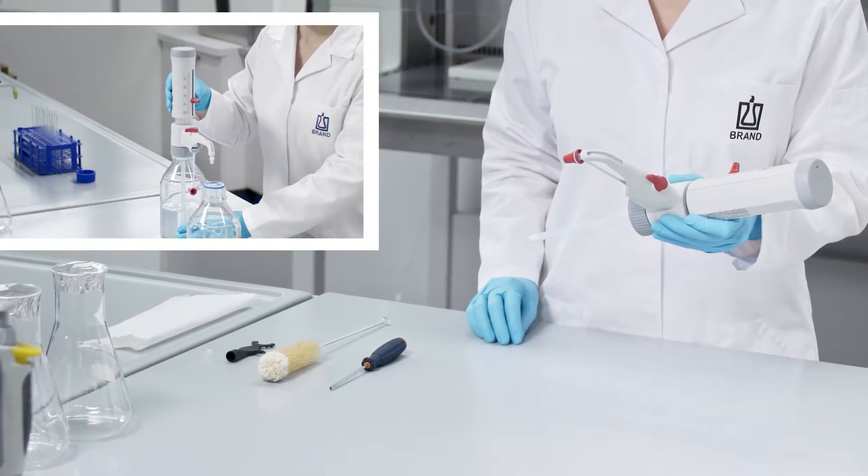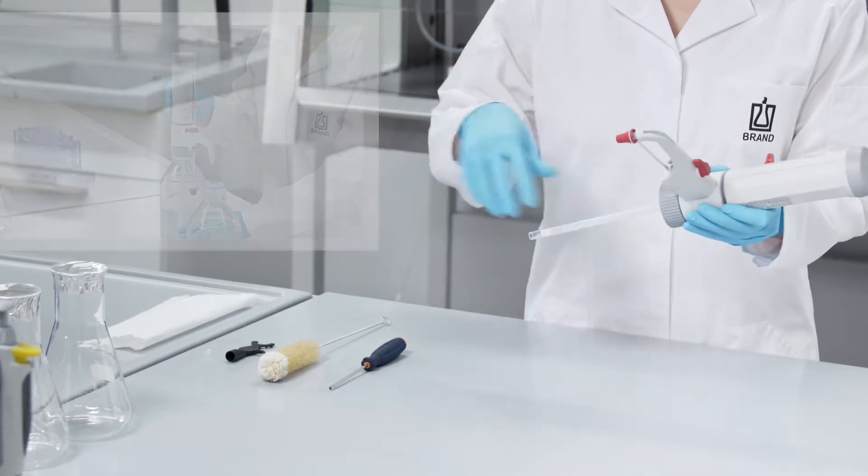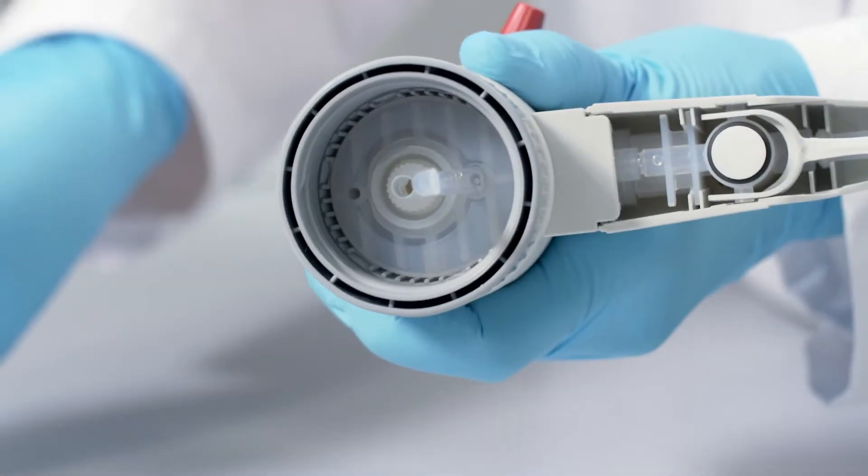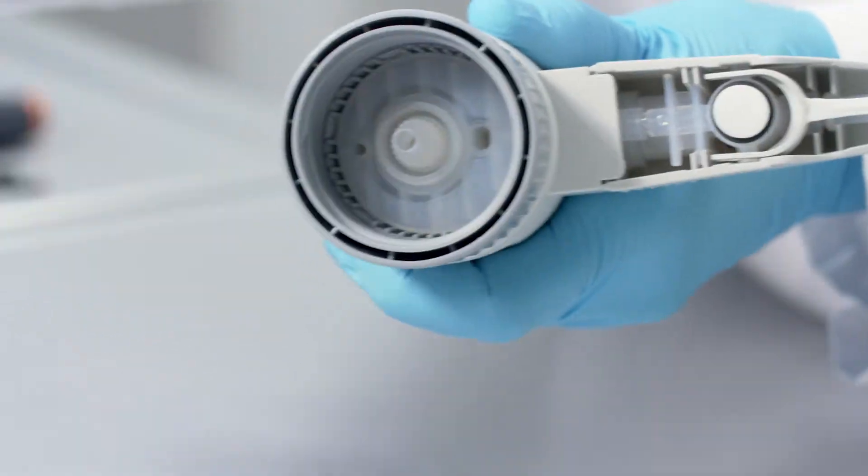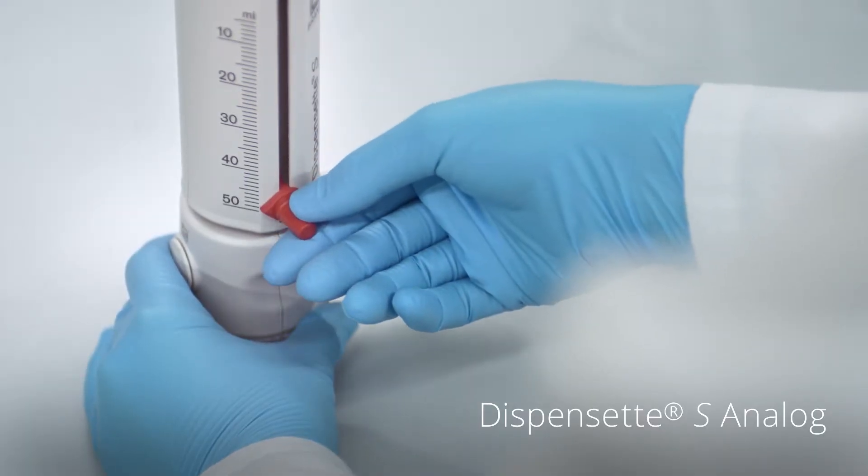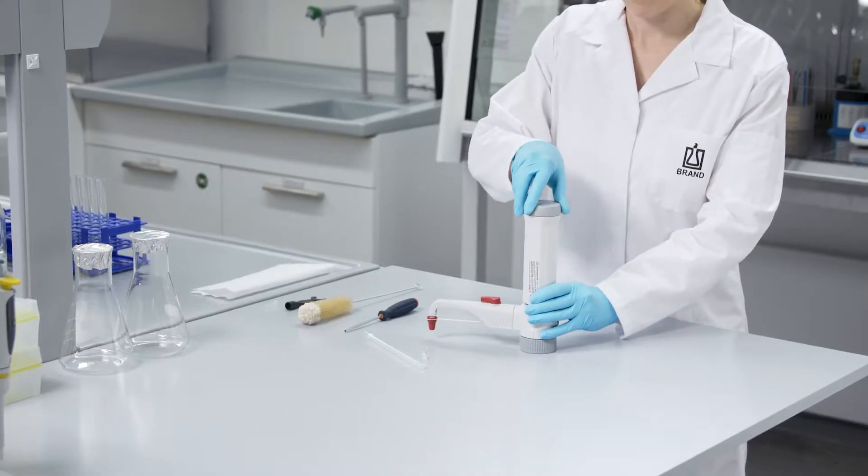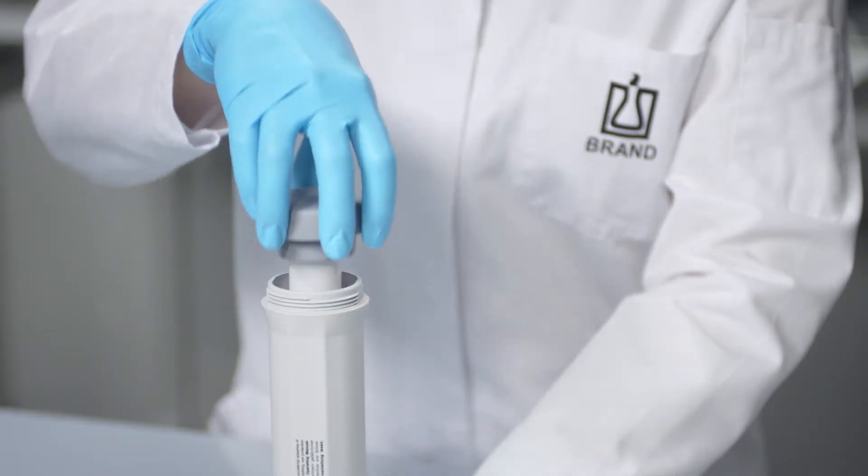Start by rinsing the instrument. Then pull out the filling tube and the optional recirculation tube. For analog models, set the instrument to the maximum volume, unscrew the piston seat completely, and carefully pull out the piston.